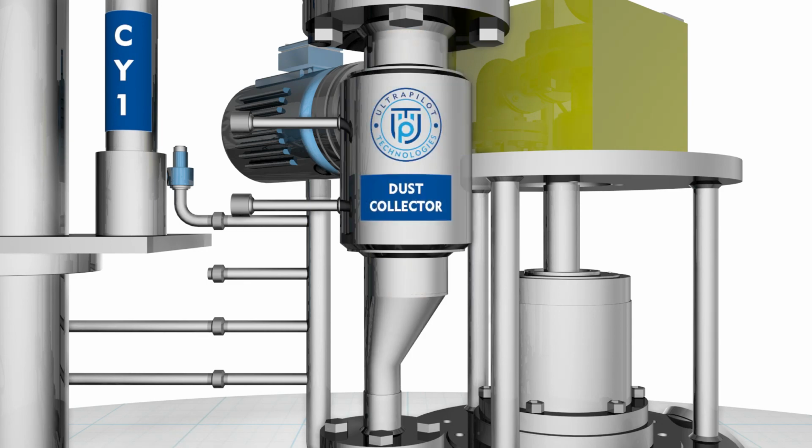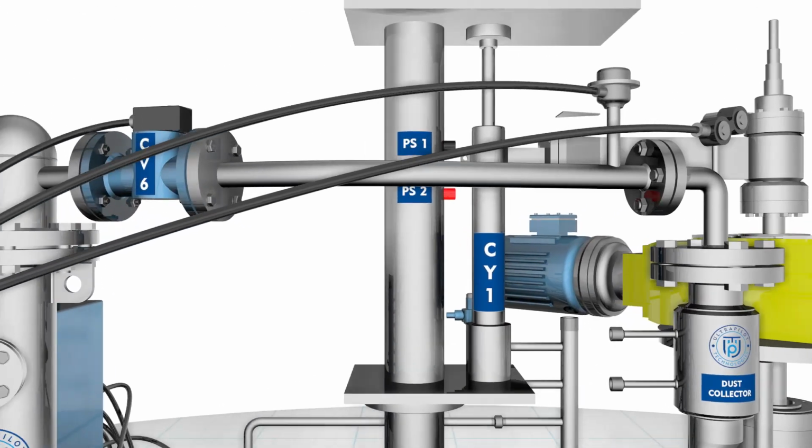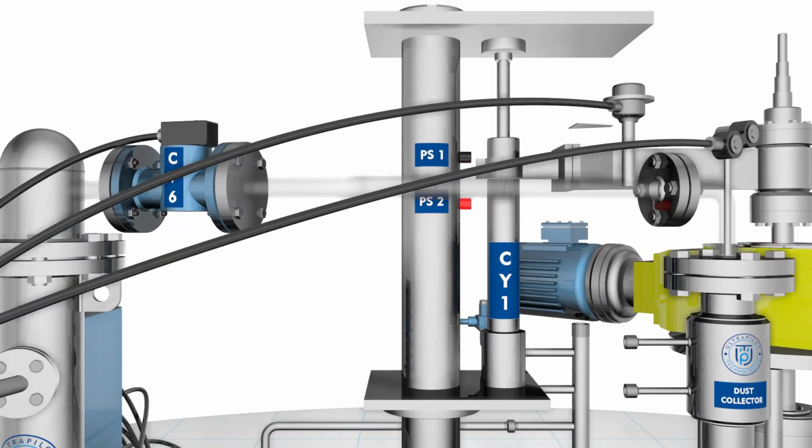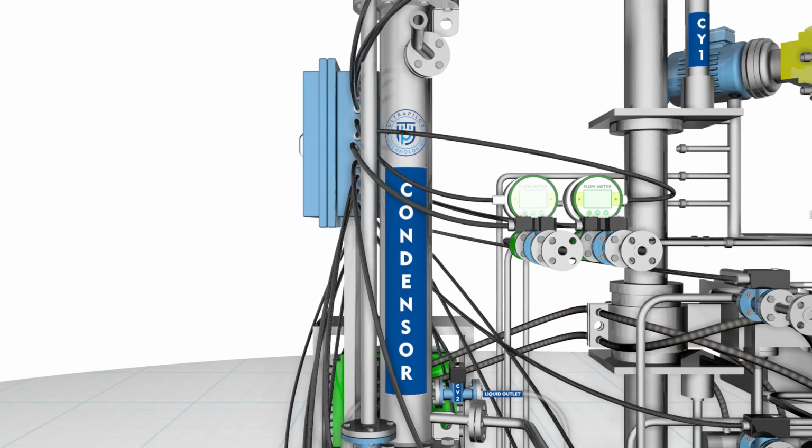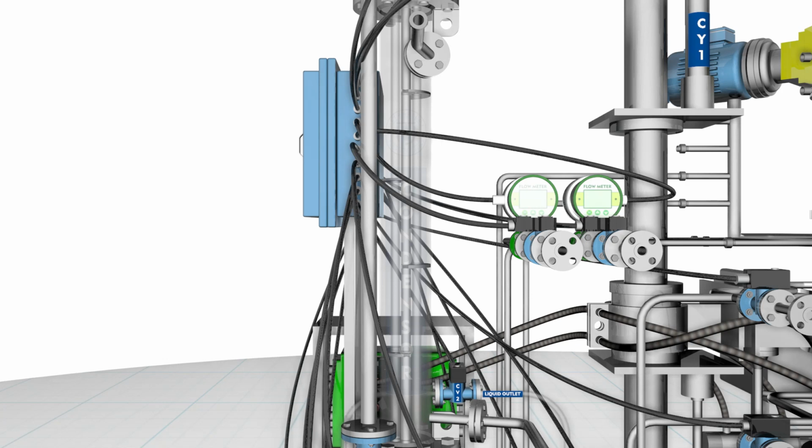The steam flow may be steplessly varied through the steam control valve CV9 for temperature control of the product by measuring the product temperature through the temperature transmitter RTD1 placed on the vessel. The completeness of the drying cycle will be measured by the vapor temperature measured through RTD2.